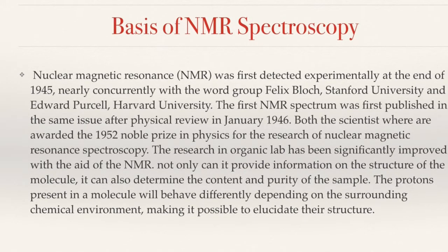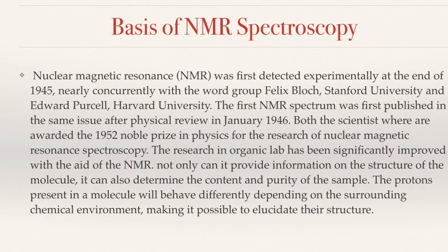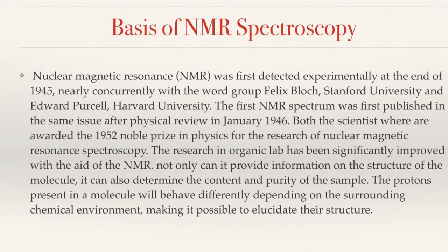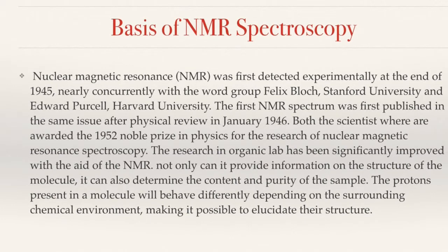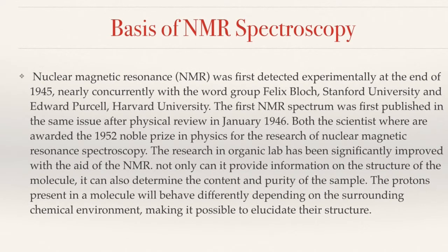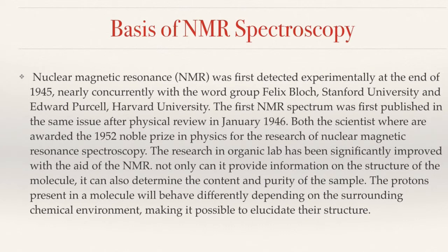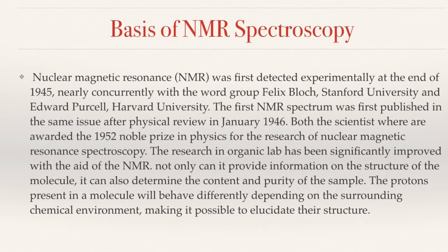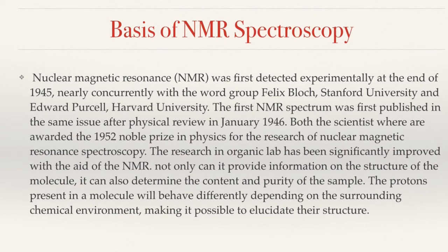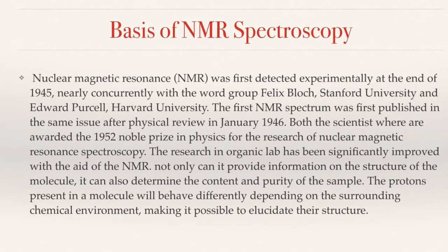The research in the organic lab has been significantly improved with the aid of NMR. Not only can it provide information on the structure of the molecule, it can also determine the content and purity of the sample. The protons present in a molecule will behave differently depending on the surrounding chemical environment, making it possible to elucidate their structure. Thank you. Now I'll request Damini Pavitra to continue with the rest.